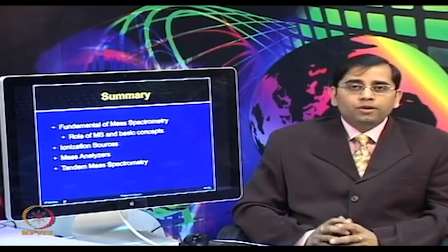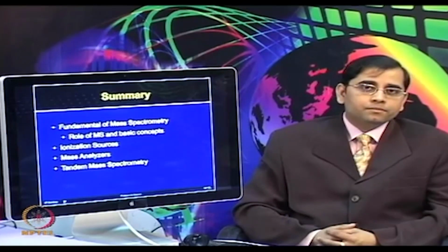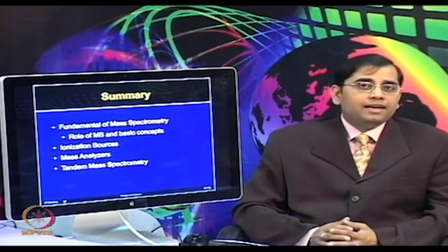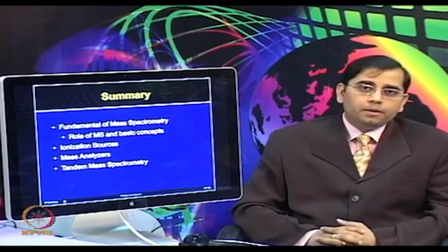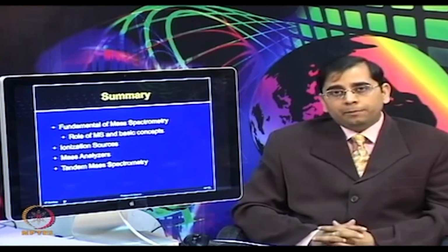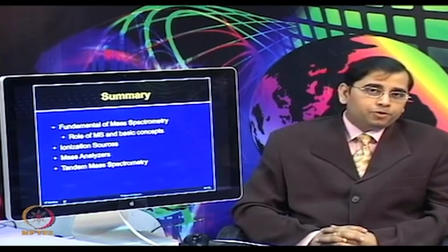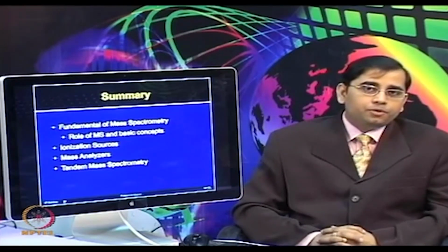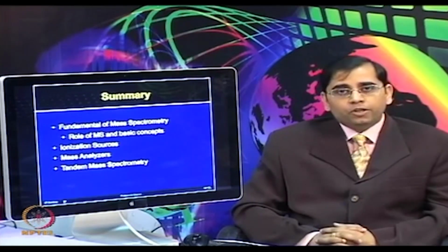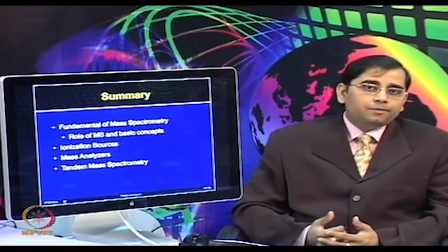One can also use the modular design, where different types of ionization sources can be combined, such as ESI and APCI. Targeted analysis can be performed for PTM, label free quantification or MRM type of assays. So, from your ideal mass spectrometer, you would like to have a wide range of applications, and that is only possible if it has very high specifications.